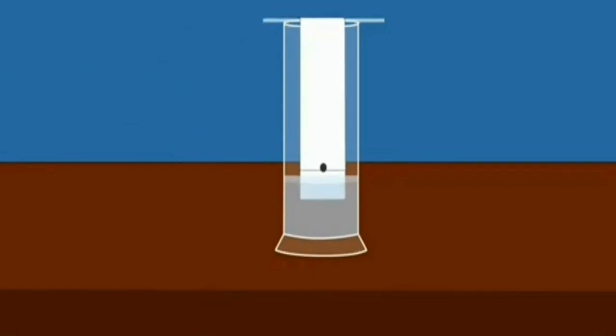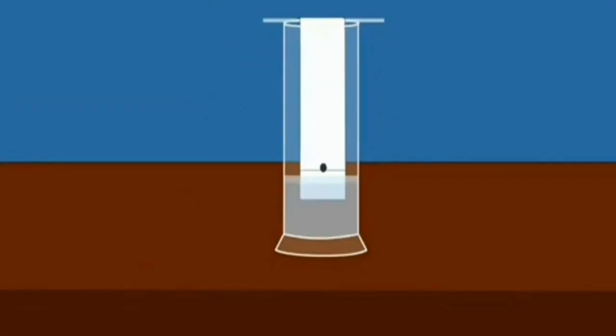Come children, let's discuss paper chromatography. This method is used to separate the different colored dyes in a sample of ink. A spot of ink is placed in the paper. This paper is then set in a suitable solvent. The black ink separates into its constituent dyes.